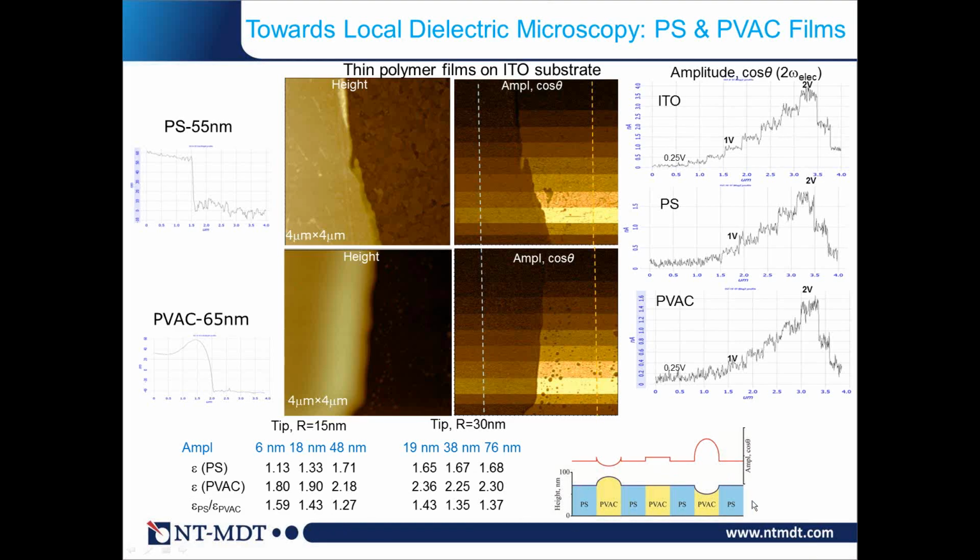And we built the model for more complicated structures, showing that despite the presence of the corrugated surface, we can still get the compositional map and assign the different regions to the different materials. This is much more difficult than in many other cases, but this is how life is arranged.